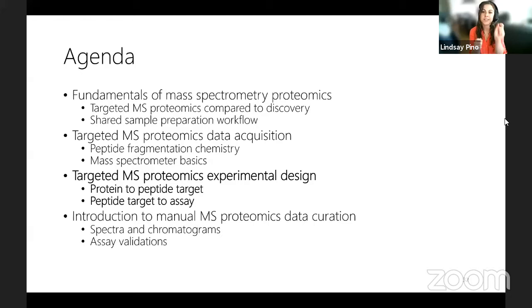So you don't want to just get, like I had showed you in that cartoon, one amino acid and then the rest of the peptide sequence. That's not a very good fragment to choose. But as long as you get 3 to 5 that are pretty much in the middle of your peptide, I think most people would agree that that's good. More is better, and with PRM, you don't really have to choose.